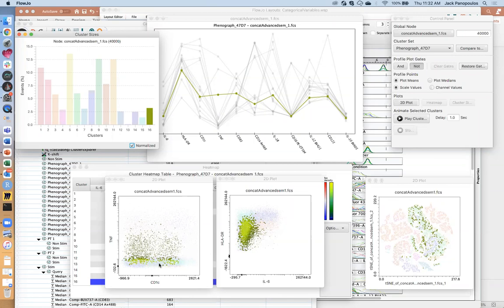Maybe narrowing the negative population would have done a better job than stretching it out as much as I did. But in any case, by looking at this graph, I'm confident that this is not a dendritic cell, although it does have some pro-inflammatory characteristics. It's negative with respect to IL-6, et cetera. But you can put as many of those plots as you want.